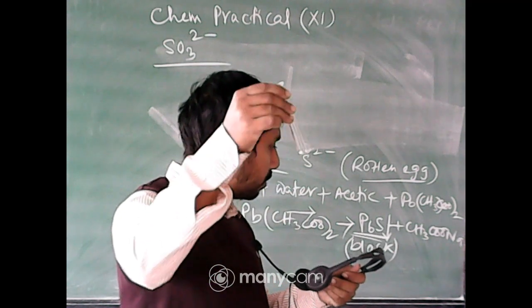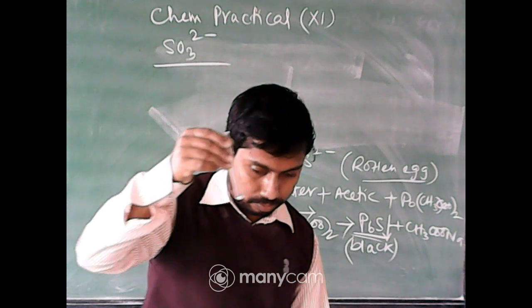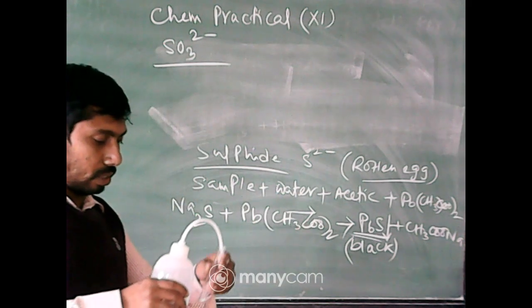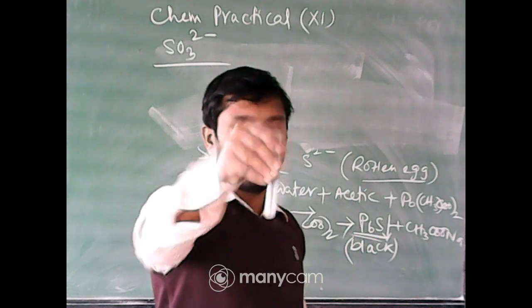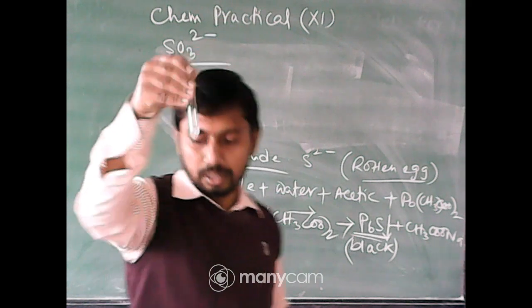Taken each time, you can see a very little amount of sample. Now, aqueous solution, just to make the solution. Yes, it is clear.